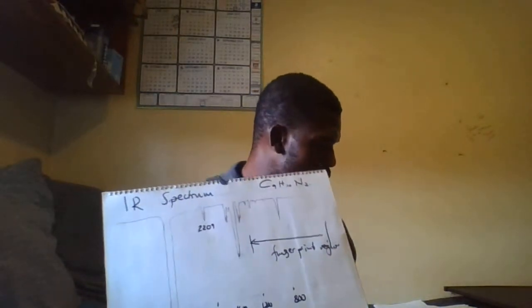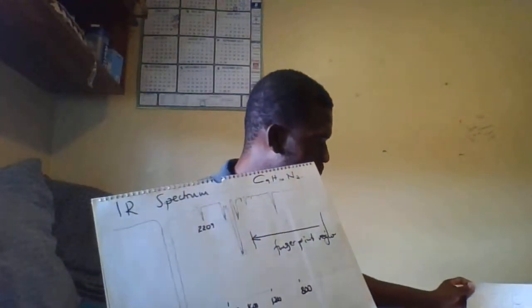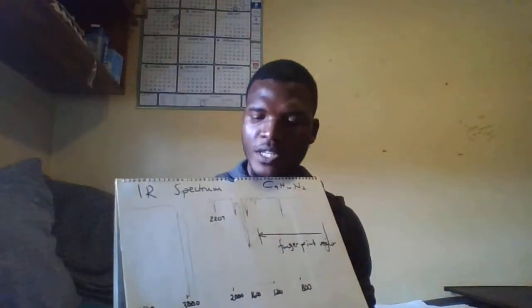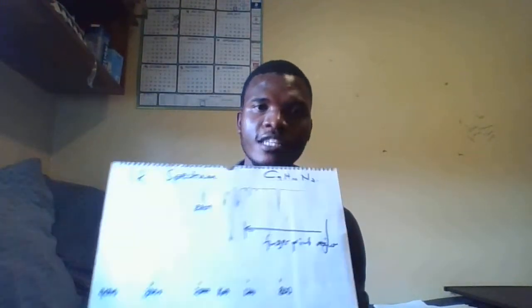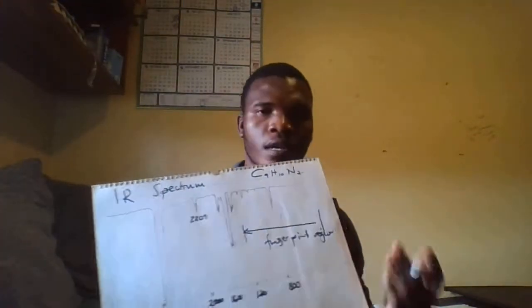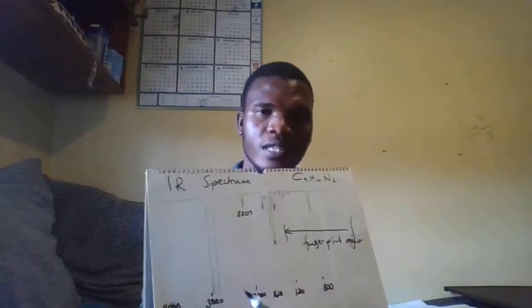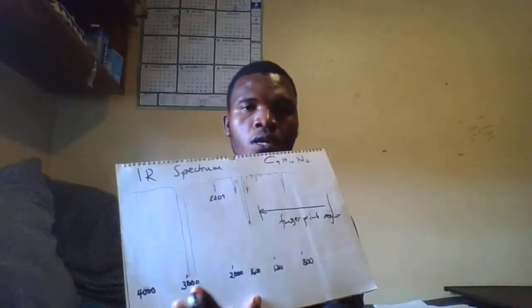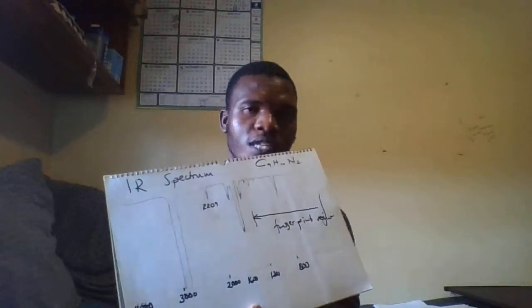Okay? So what we suspect in this case, I'm just going to give, because textbooks do differ when they give these ranges. Some textbooks give you a range of values to say from 2.5 to 4,000.